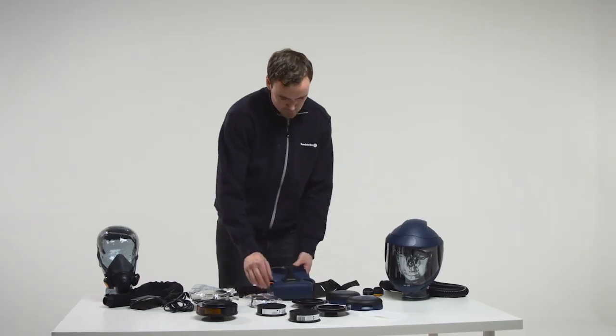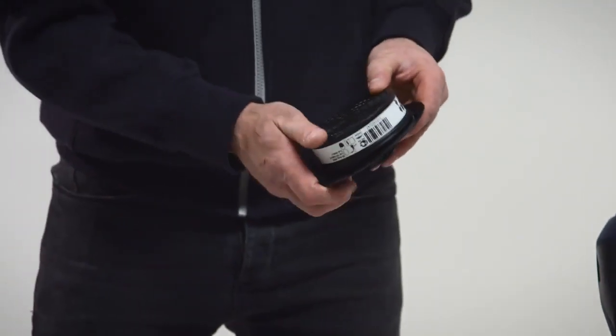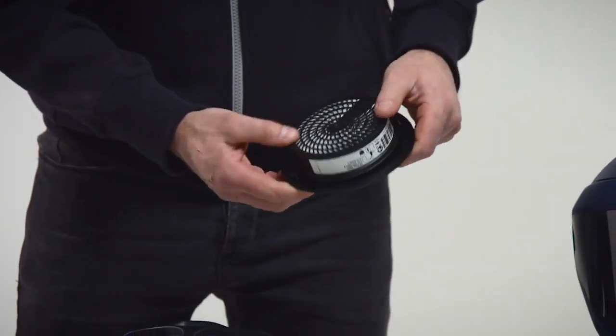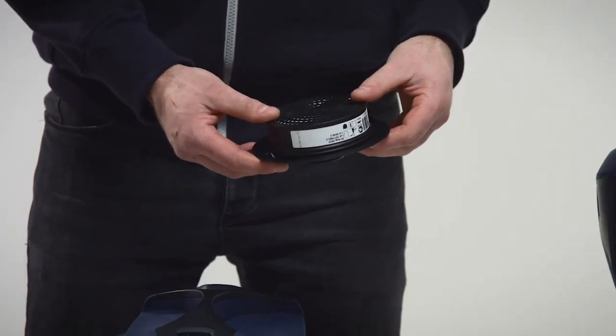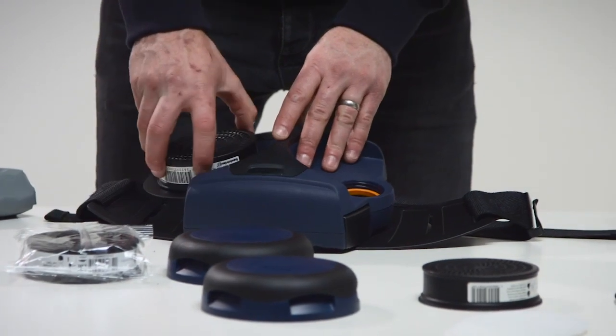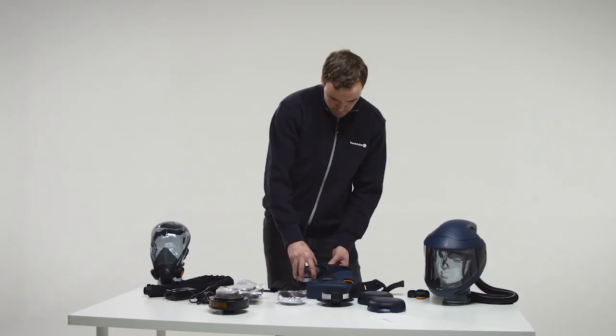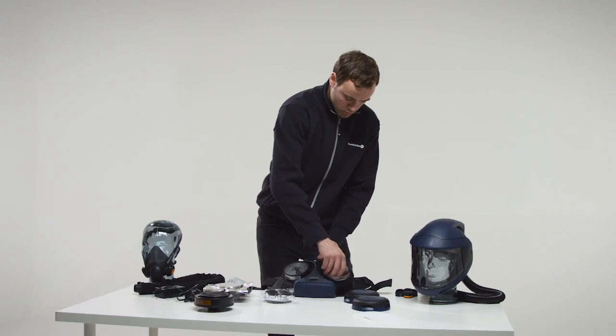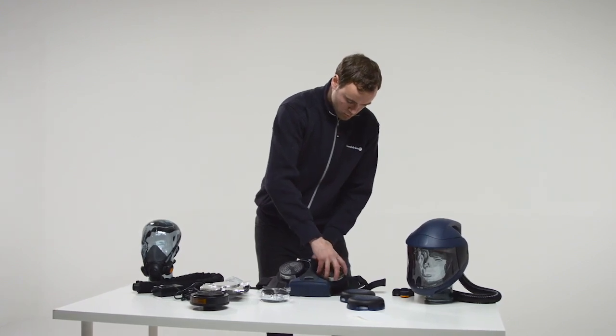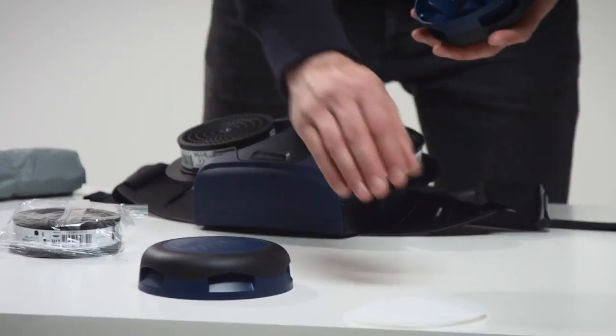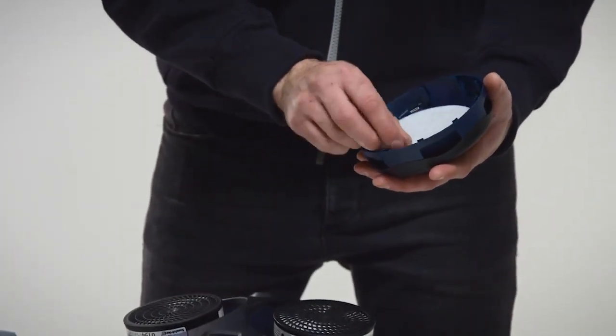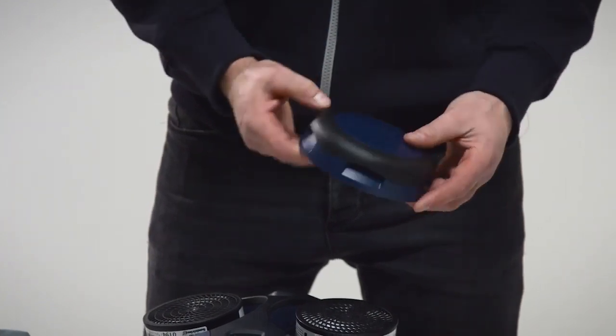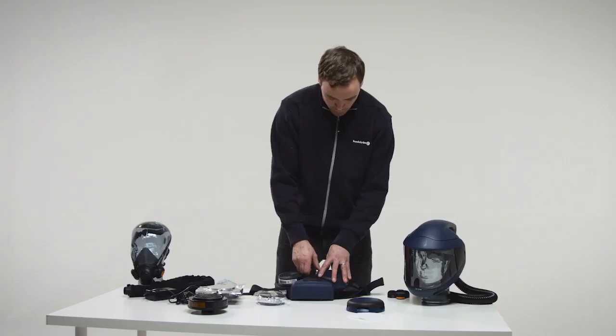Check that the gaskets in the filter mounting of the fan unit are in place and are in good condition. Particle filter SR510. Snap the particle filter onto the filter adapter. Do not press onto the center of the filter. It might damage the filter paper. Screw the adapter into the filter mounting so far that the adapter will be in contact with the gasket. Then turn it about one eighth turn further in order to ensure a good seal. Fit one pre-filter into the pre-filter holder. Press the pre-filter holder onto the particle filter.